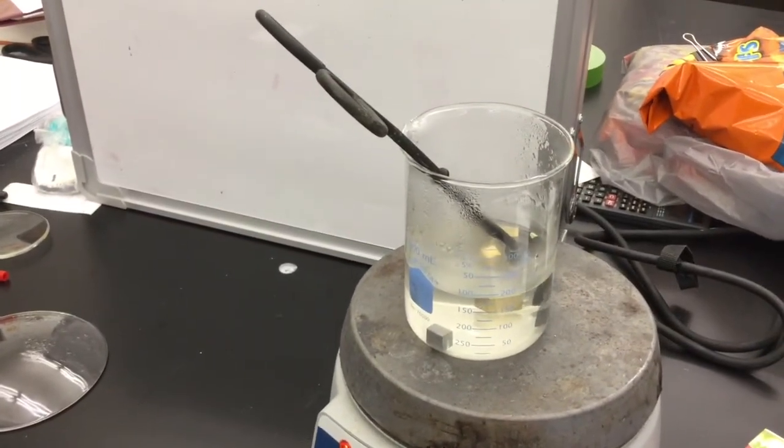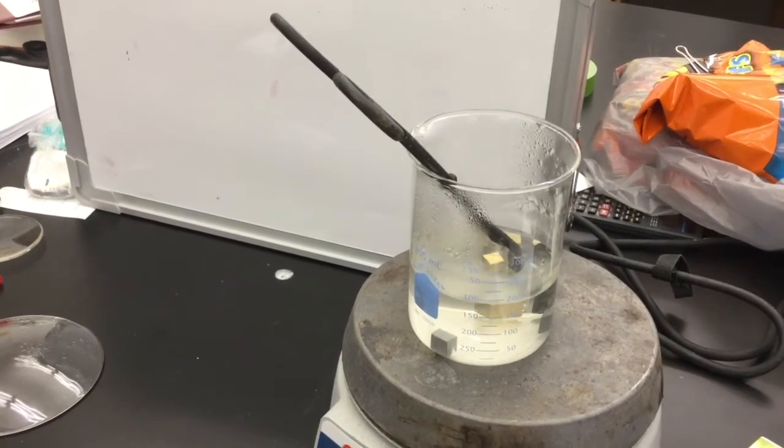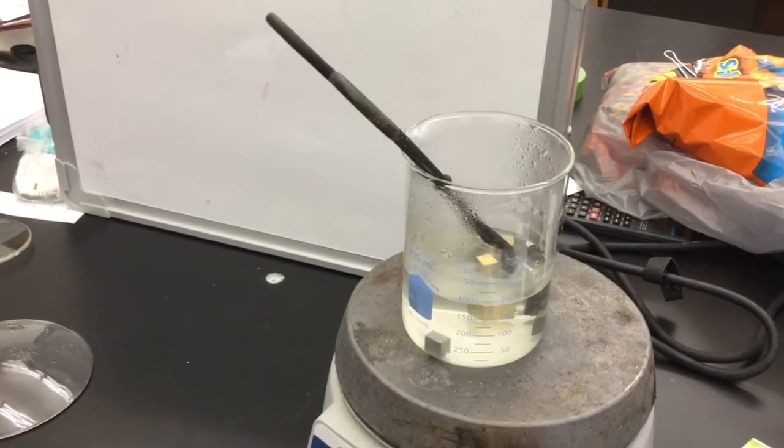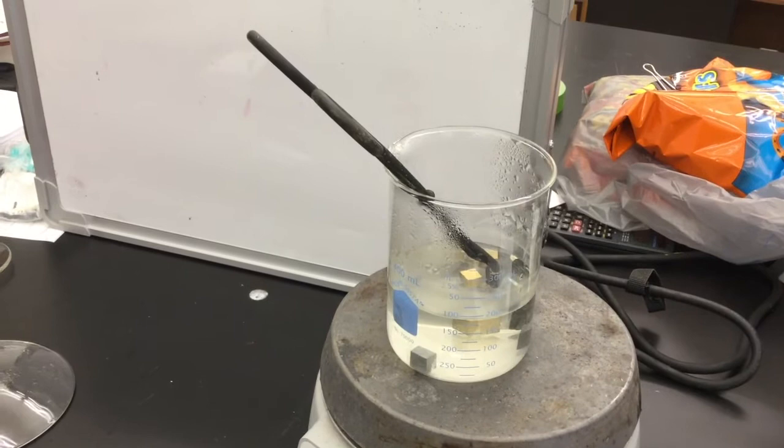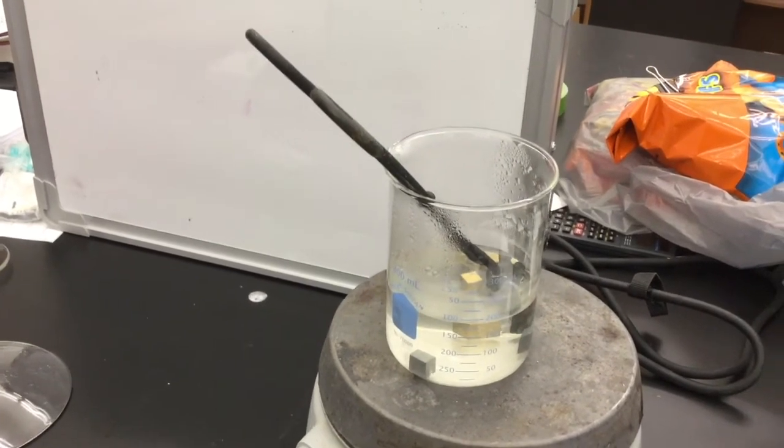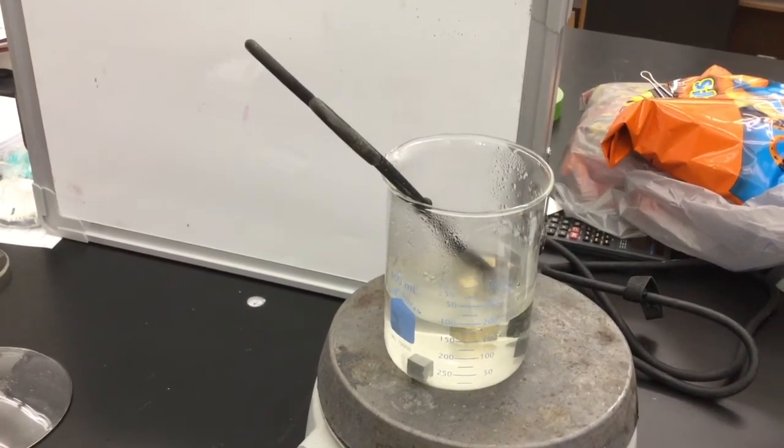Place your tongs into the beaker of hot water for the last minute or two before you remove the metal pieces. This way you are not transferring heat to the tongs from the metal pieces that need to be transferred to the water.